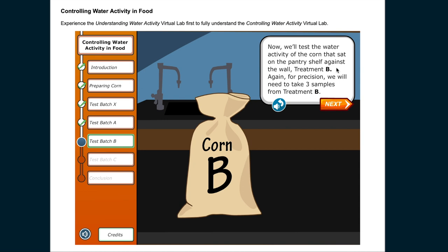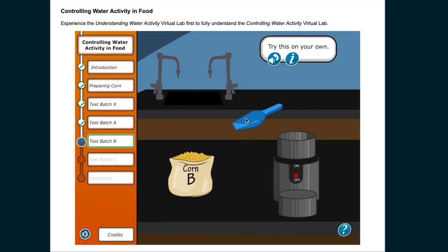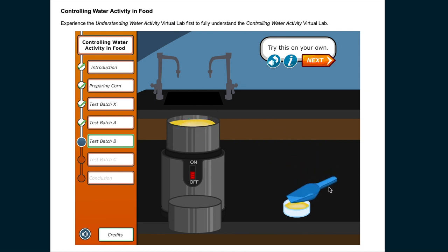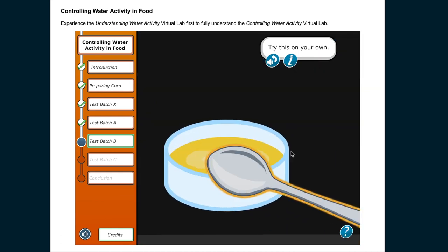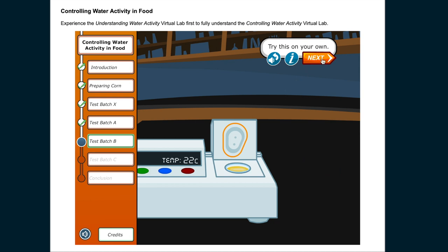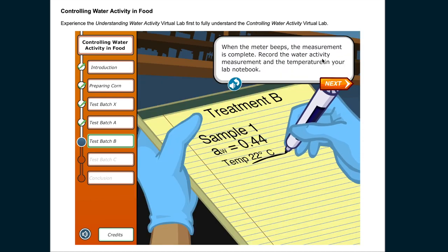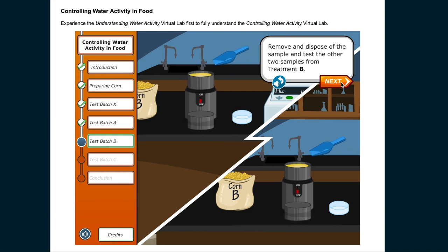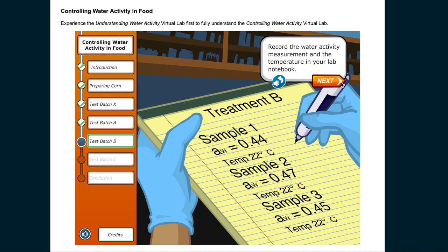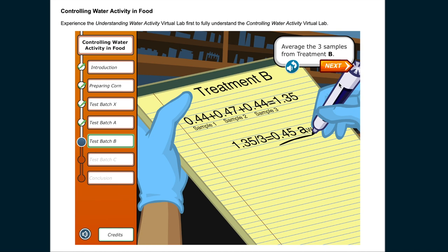Now we'll test the water activity of the corn that sat on the pantry shelf against the wall, treatment B. Again, for precision, we will need to take three samples from treatment B. Try this on your own. When the meter beeps, the measurement is complete. Record the water activity measurement and the temperature in your lab notebook. Remove and dispose of the sample and test the other two samples from treatment B. Record the water activity measurement and the temperature in your lab notebook. Average the three samples from treatment B.